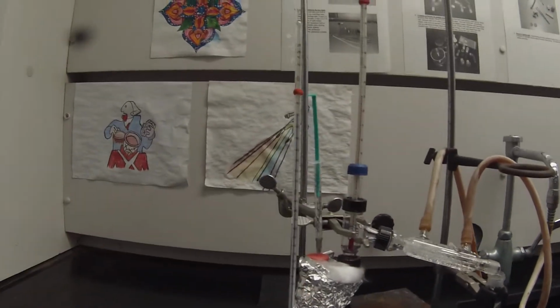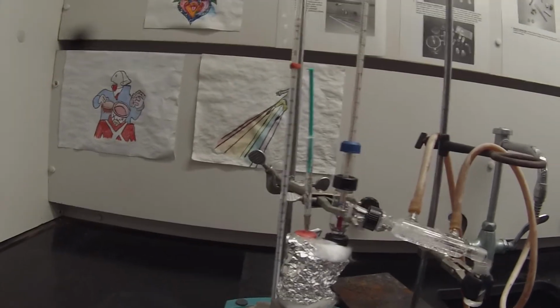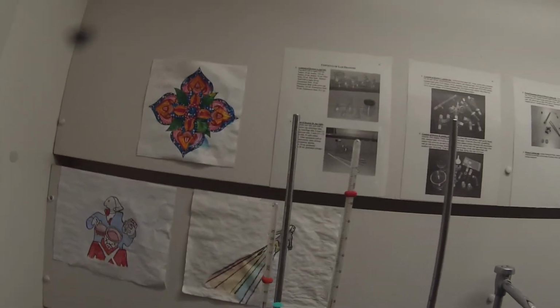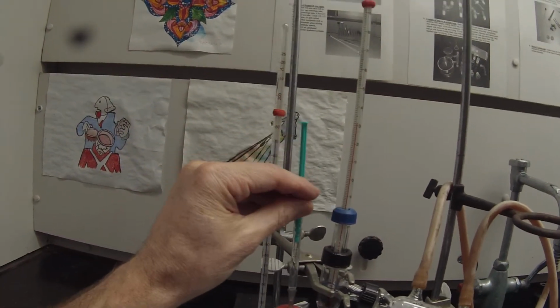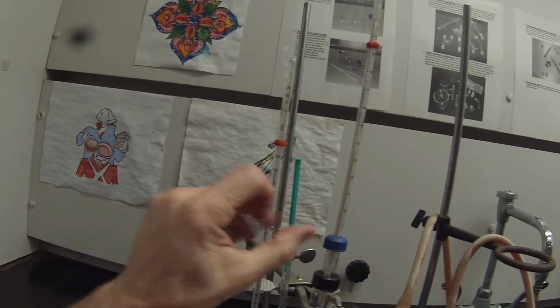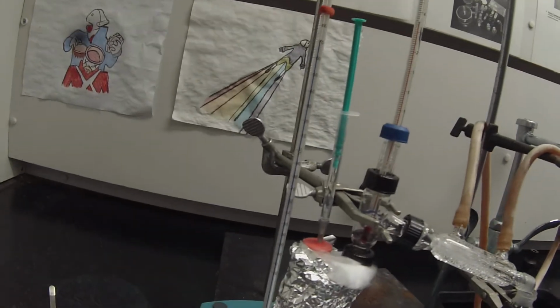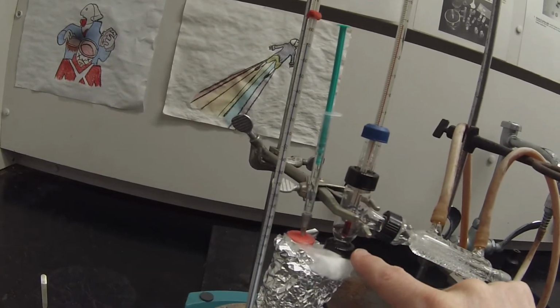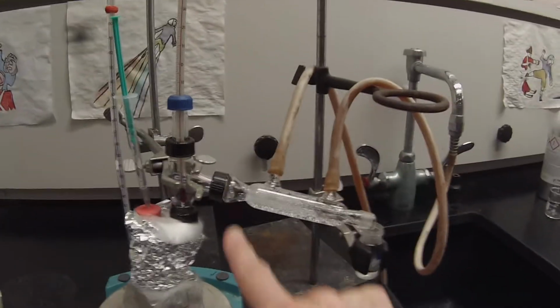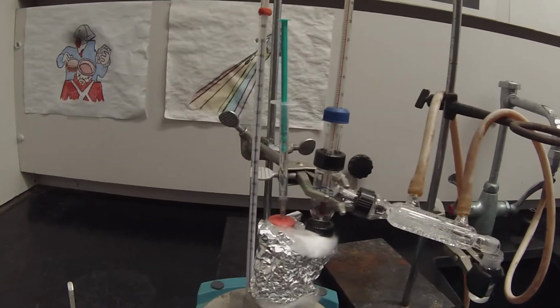Nice and warm in there. Definitely rising. We're a little over 30 now. Another half mil. I'm definitely starting to see some liquid condensing around the sides there. And this is rising up to 40, so we should start seeing some distillate collecting fairly soon.